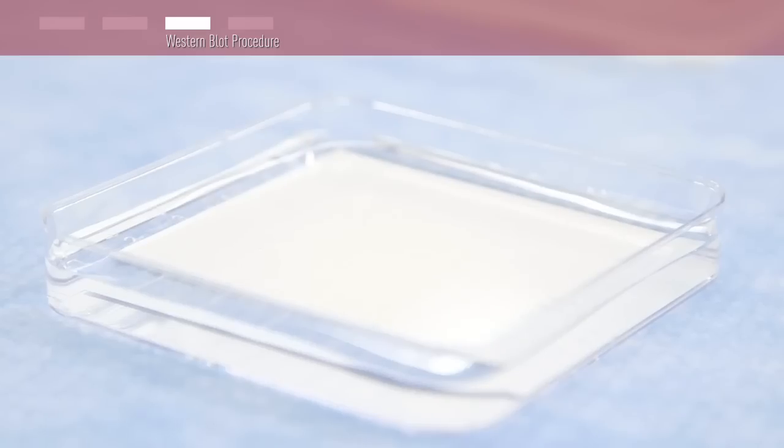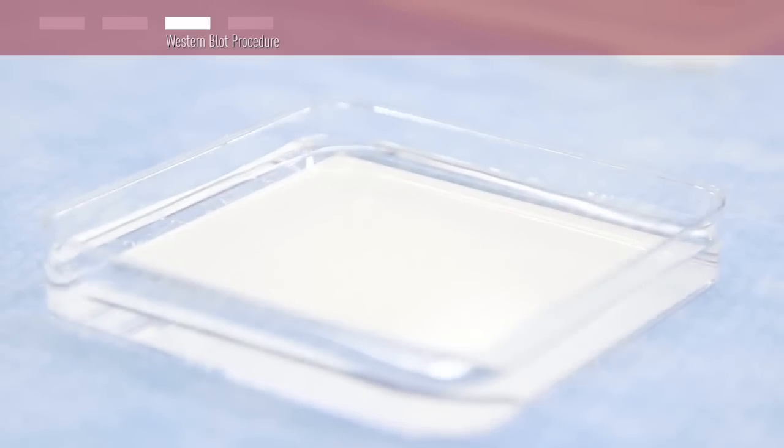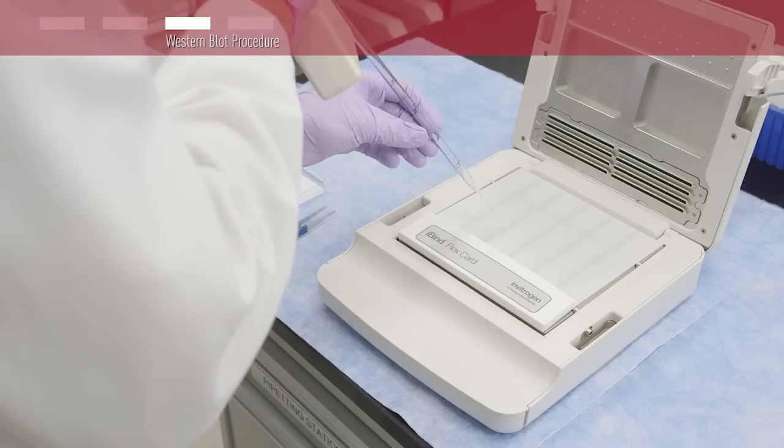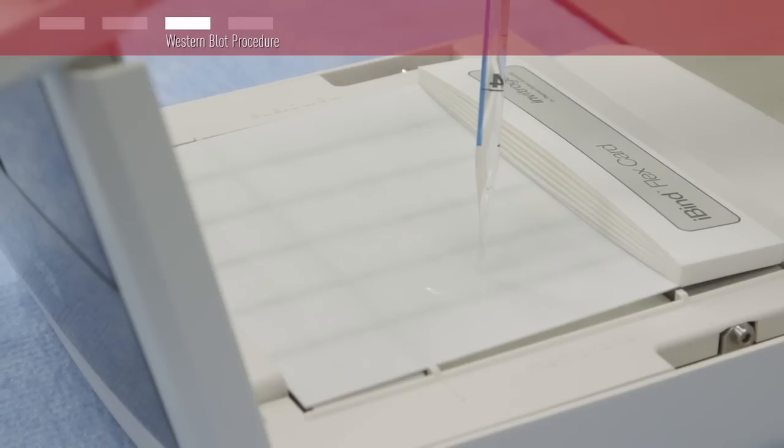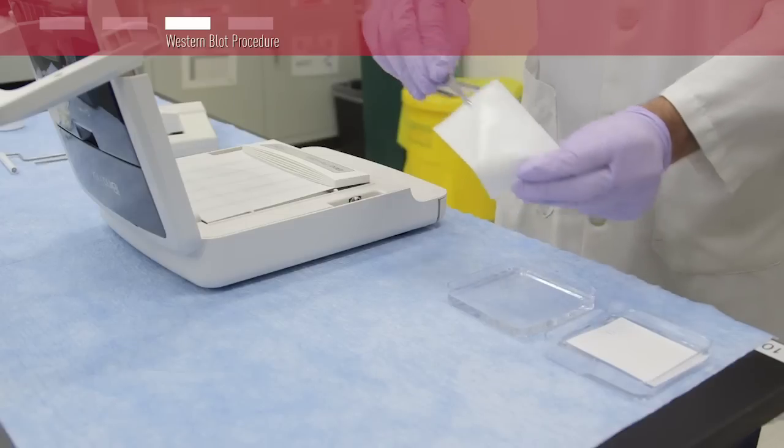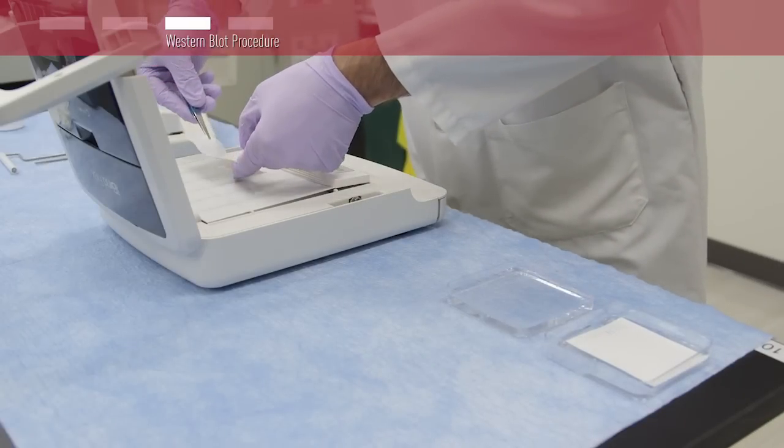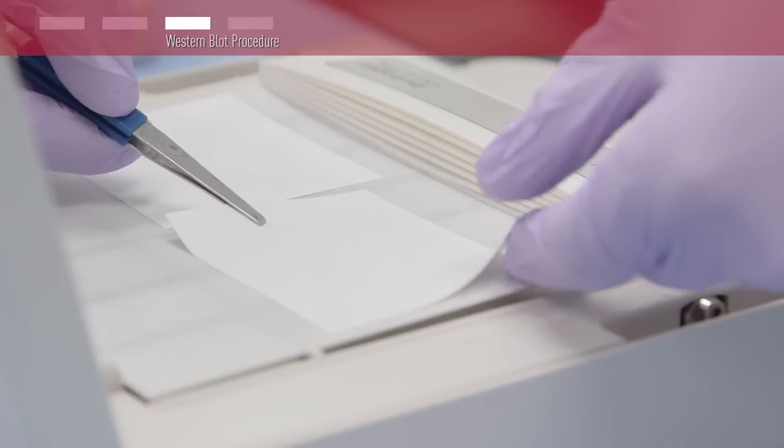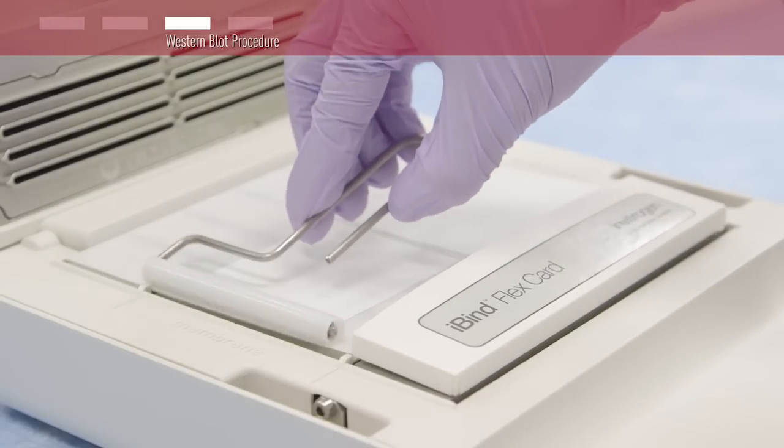In order to process up to 2 mini blots, first make sure the mini well insert is installed. Add an additional 1 milliliter of 1X iBind Flex solution for each blot to the card, allowing it to pool per the quick reference card for mini sized blots. Use the center alignment guide to place your blots on either side. Continue with rolling the blots to remove air bubbles.